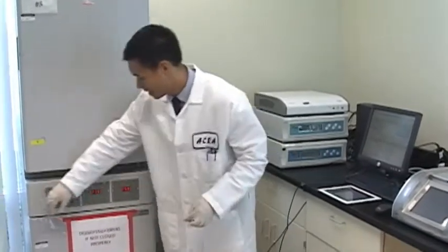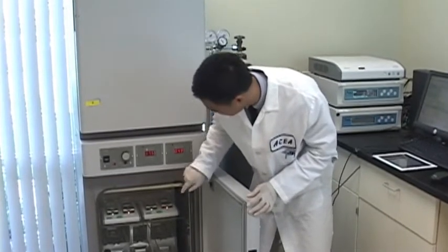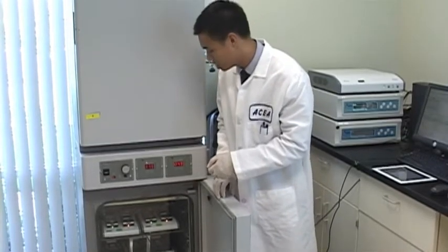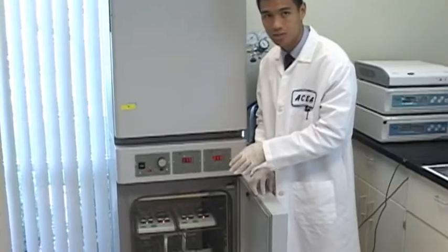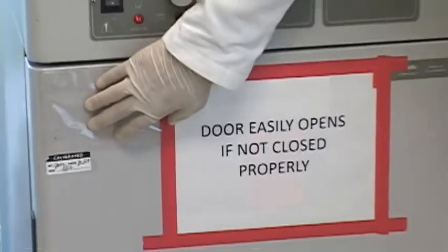Now fortunately, with the iCelligence platform, there are two ways you could do this. One which we term on the fly, meaning taking your compounds out from underneath your tissue culture hood, bringing it straight to the incubator. And the cradle design is such that you can actually remove the lid of the E-plate without having to disengage the device. And so you can pretty much minimize the time in between adding your compound as well as putting it back onto the incubator to start taking your readings. The second way you can set up your receptor signaling assays is to take the E-plate out, bring it to your tissue culture hood, add your compounds there, and then place it back onto the station.